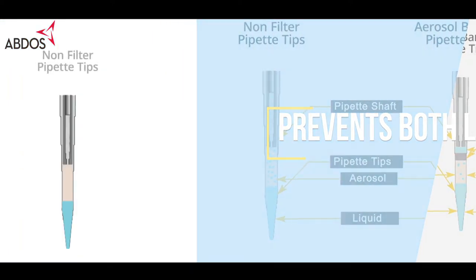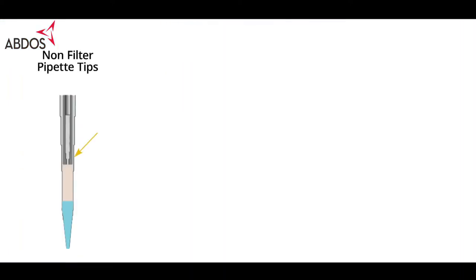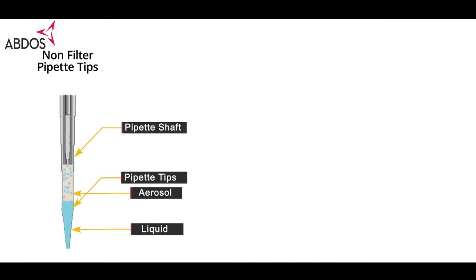When using non-filter pipette tips, inappropriate pipetting or contaminated samples may contaminate the pipette, as there is no barrier to prevent liquid or aerosol from entering the pipette shaft. This can affect your experiment and you may lose your precious samples.